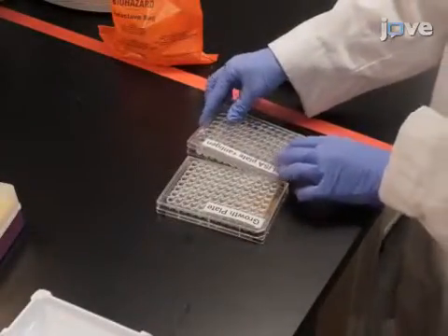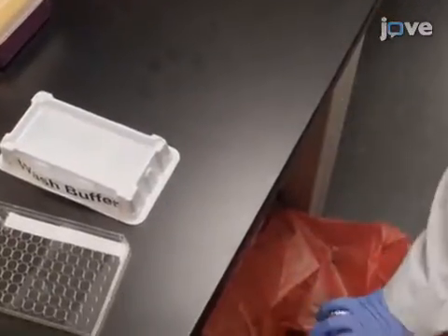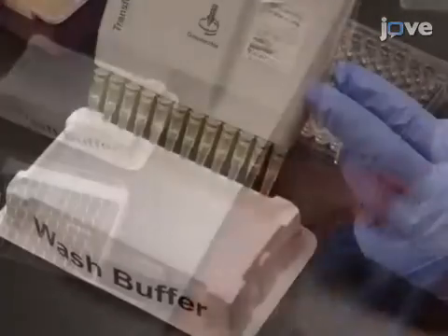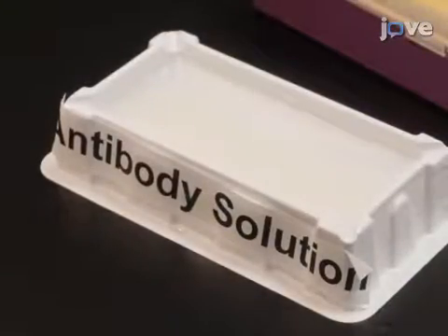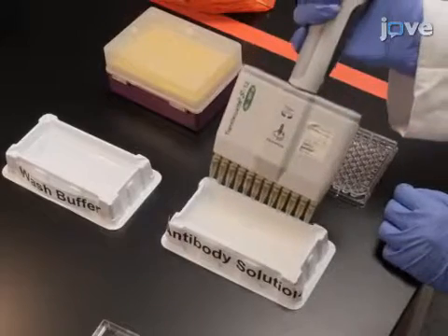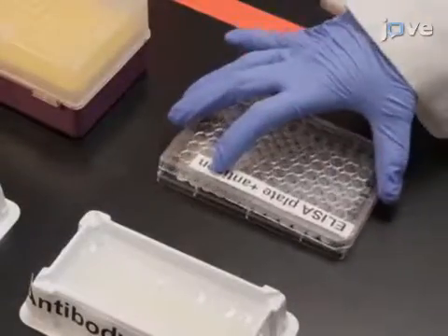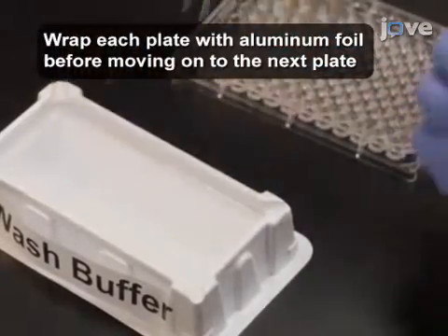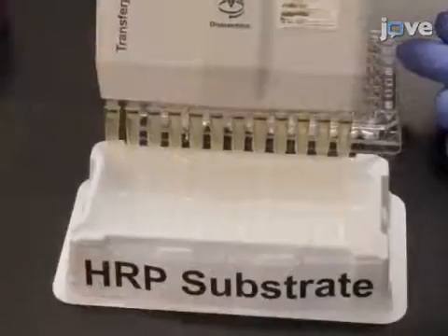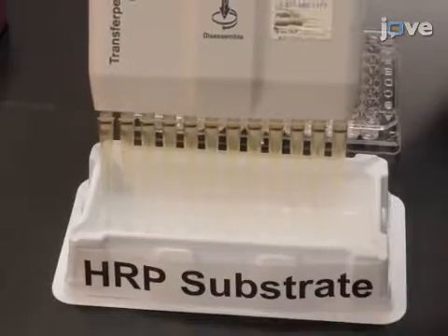Incubate the plates at room temperature for 1 to 2 hours. Then empty the samples from the ELISA plate and wash the wells 4 times. Afterward, prepare the antibody solution to detect SCFVs according to the text protocol. Add 50 microliters of the antibody to each well and incubate for 1 to 2 hours at room temperature. Wash the ELISA plates 4 times with wash buffer before adding 200 microliters per well of HRP substrate prepared according to the manufacturer's protocol.